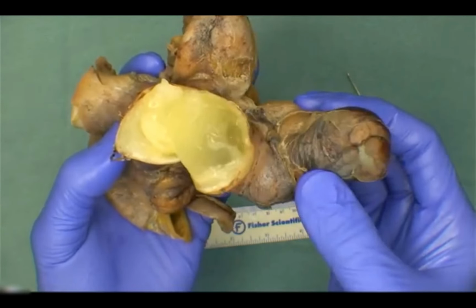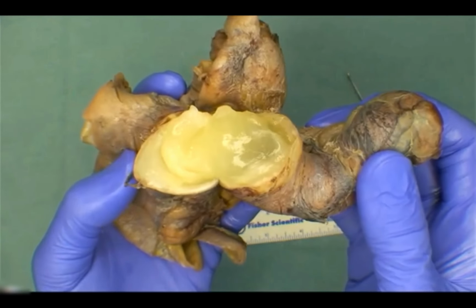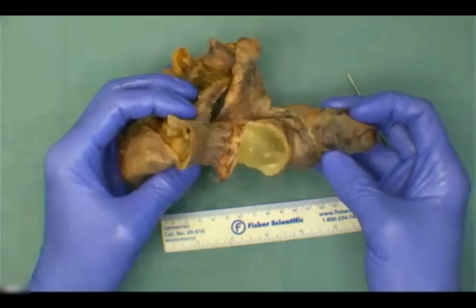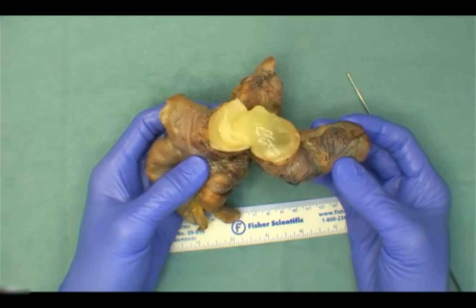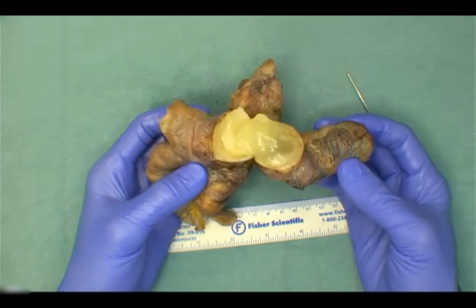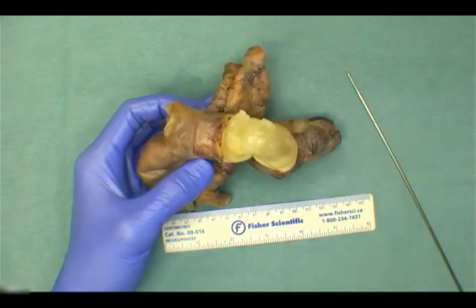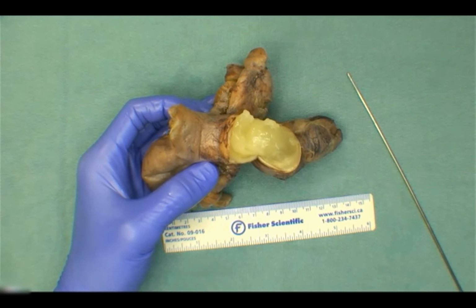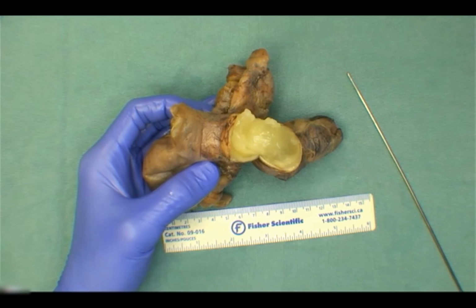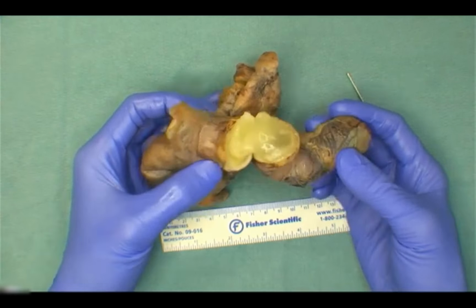Any other features we want to look for and be sensitive to as we gross the specimen? So perhaps some diverticula. Isn't an appendix technically a diverticulum? It is a true diverticulum. Oh, fecalith is a good one. Yes. Excellent. Okay, good. So yeah, we want to be able to look for a lot of those features, right? We want to take a look at making sure that there are any excrescences or more solid elements to the lesion itself. We definitely want to evaluate if there's any defects of the serosa, which I'm assuming we're talking about.